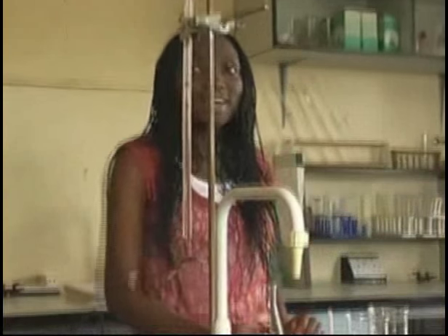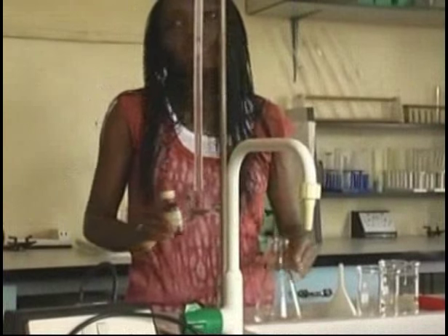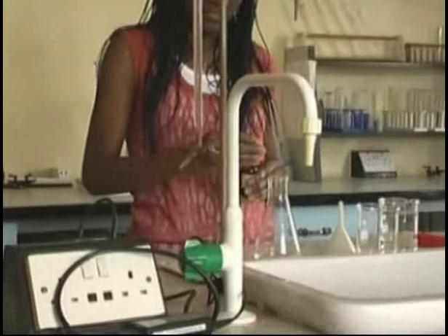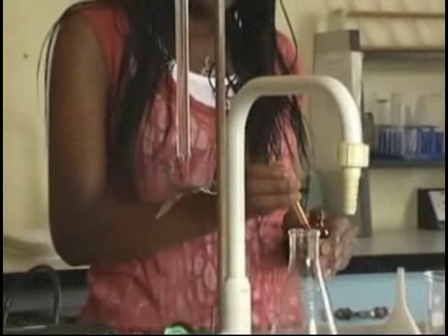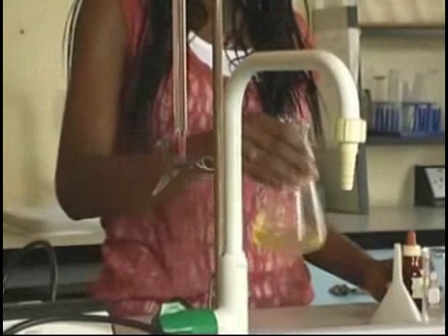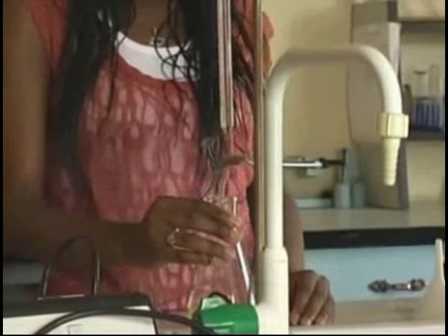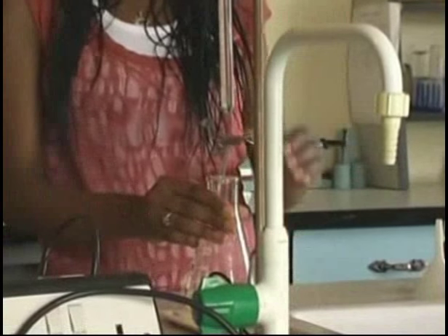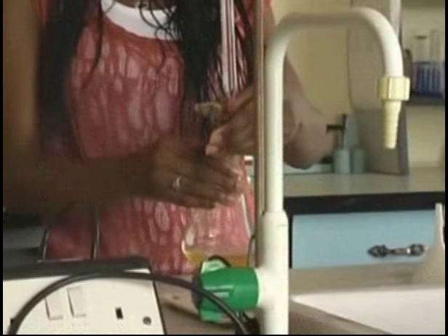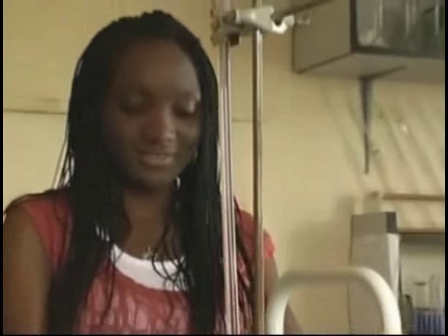Now I'm going to add 2 drops of the indicator methyl orange into the base. The base is going to turn orange. Now I'm going to carry out the titration. I'm going to add a little of the acid, bit by bit, and I'm going to shake the conical flask until the end point is reached.